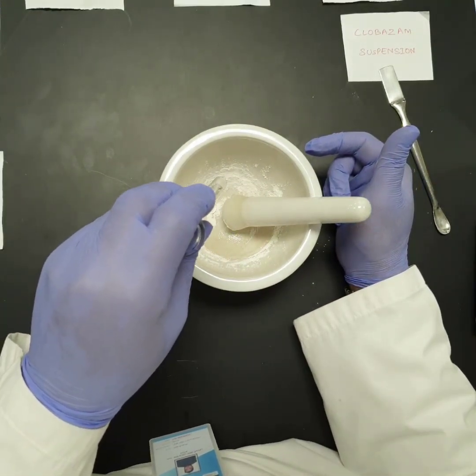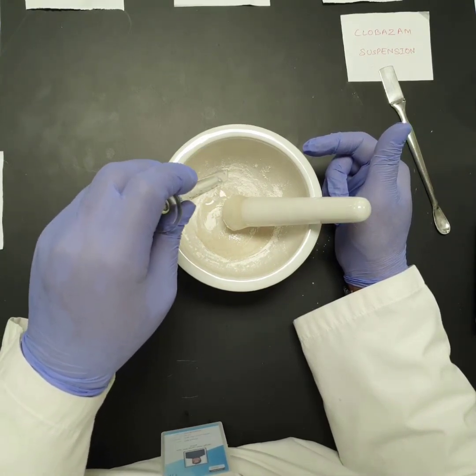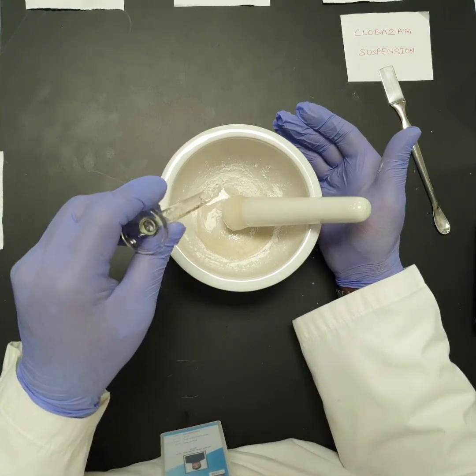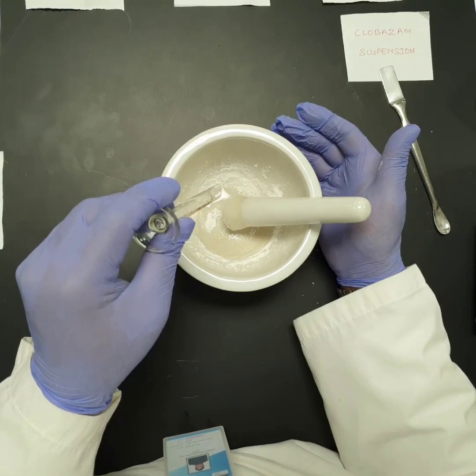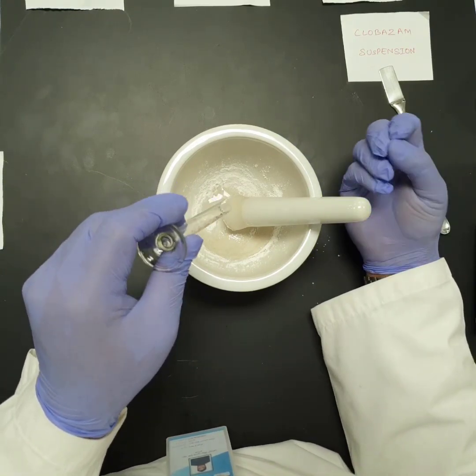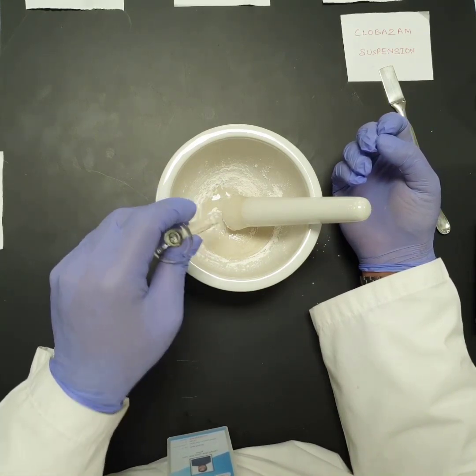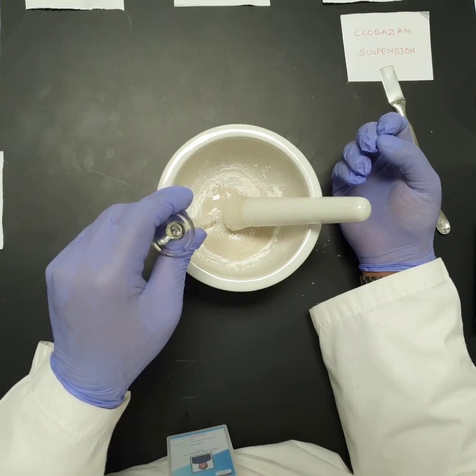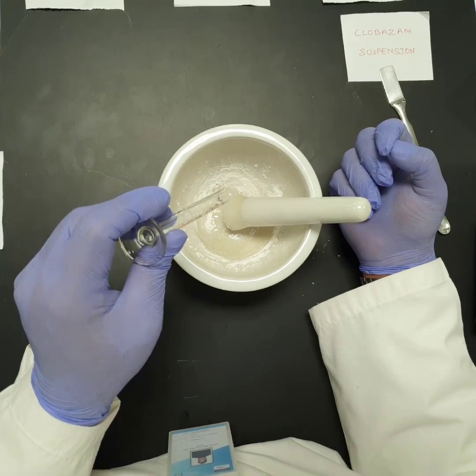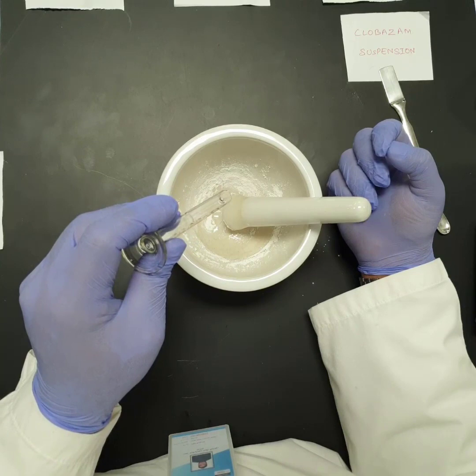As you can see, glycerol is a very thick and viscous liquid, so the proper way to drain this type of liquid from the graduated cylinder is to wait for some time until the last drop falls, so that we will have all the 3 ml of glycerol in our mortar. Still you can see the drop is forming and falling down in the mortar. So I have to wait for a few seconds more.